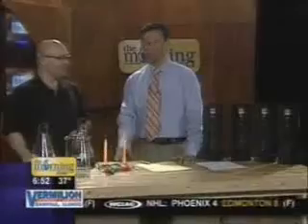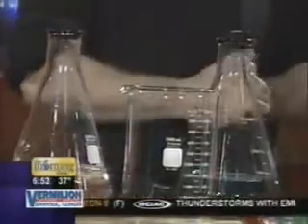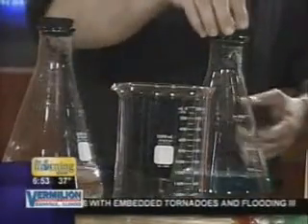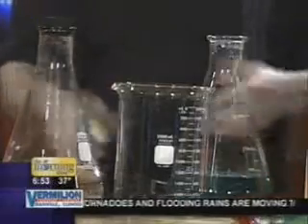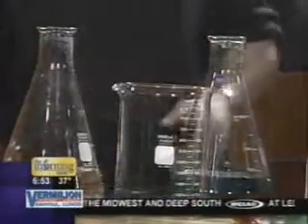I'm going to show that here in a kind of behind-the-scenes type of reaction. This is luminol, and actually I don't know what station CSI is on, but it's okay. I think it's on ours. They have like 3 of them. I know they're all over the place now. It's real popular. But anyway, you see them use luminol to show up blood. When luminol complexes with the iron, and we use copper instead, they'll spray the luminol on where they think blood is. Then they put an activator on there, and it glows, or under black light.